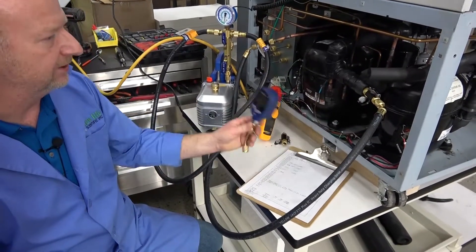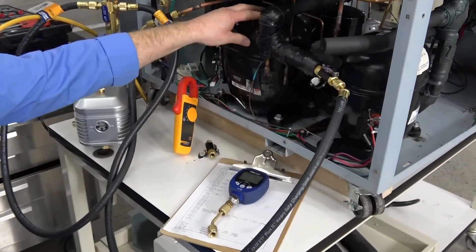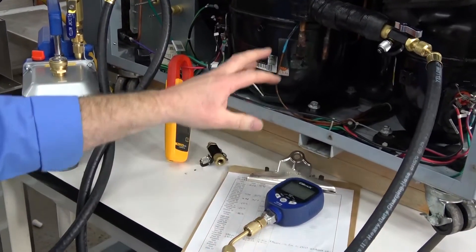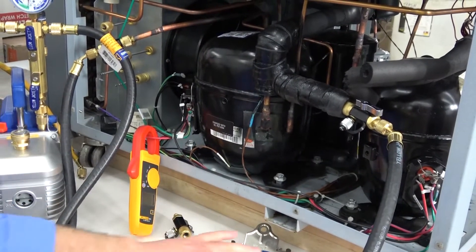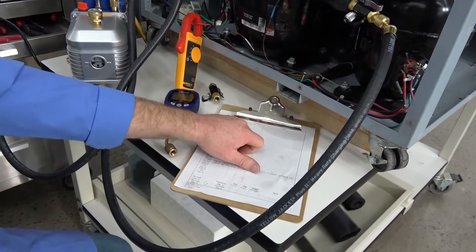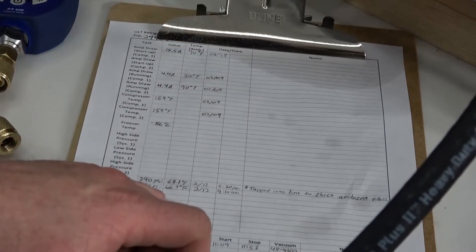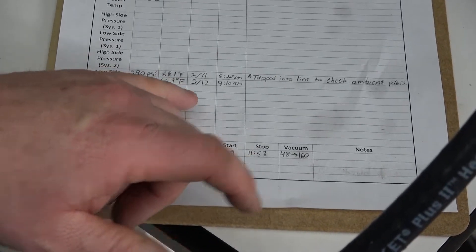If we need to get into a system a little deeper, we do pressure tests. Specifically, when we break into a system like we did here to change a compressor, we get the compressor changed, do a high-pressure test using gauges like this, and check temperatures. Once it passes the pressure test, we fill in our checklist documenting everything we've done — amp draws on both compressors, temperatures, and the pressure test results.